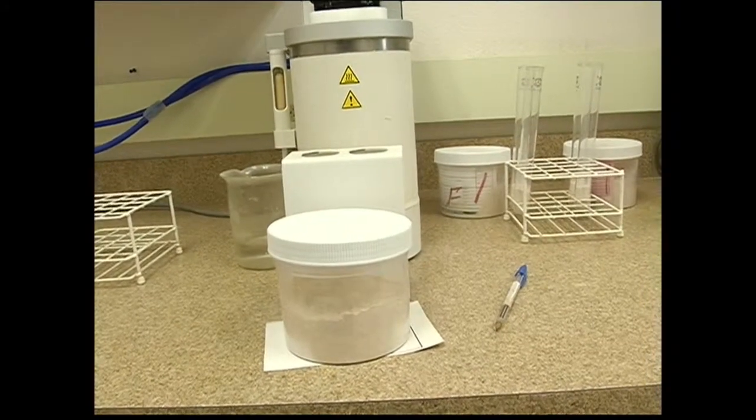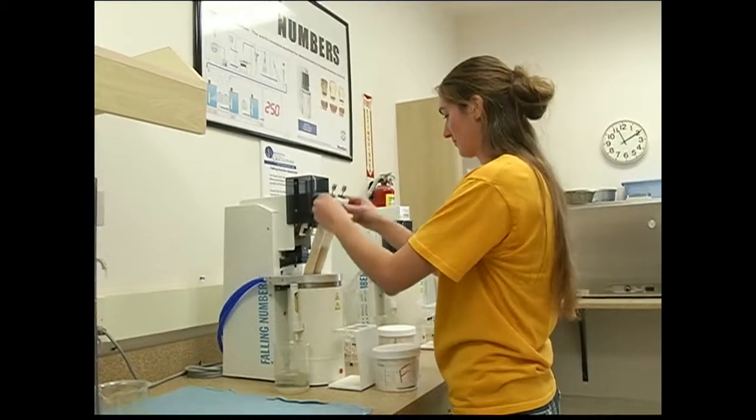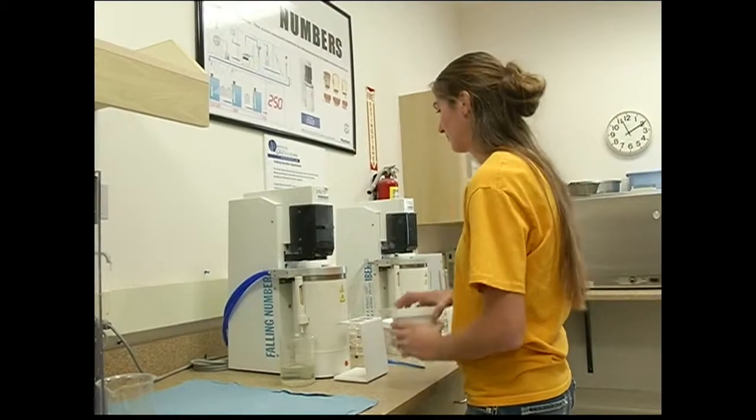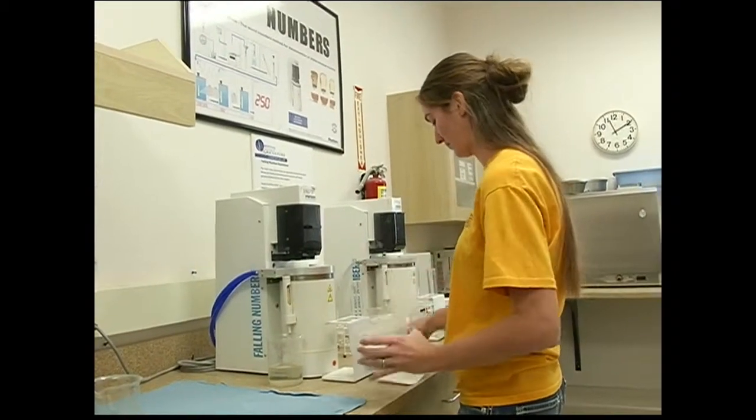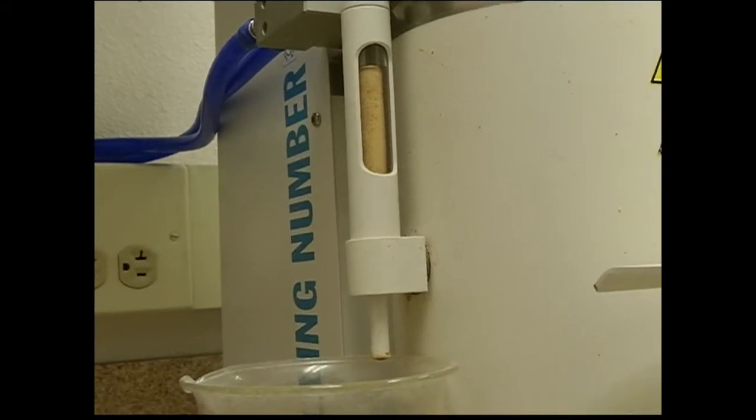Rumney says in a normal year, the State Grain Lab runs about 15,000 falling numbers tests. He says the falling numbers test is important because of all the evaluations, it is one of the least understood. As a producer, most producers have a fairly good understanding of the grading process, what test weight means, what shrunken and broken means, what damage means, because you can see those things out of your combine. You can see damaged kernels or undamaged kernels. But falling numbers, most producers don't really have a good understanding of it.